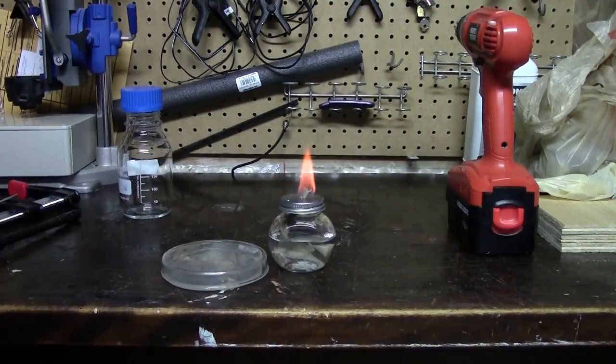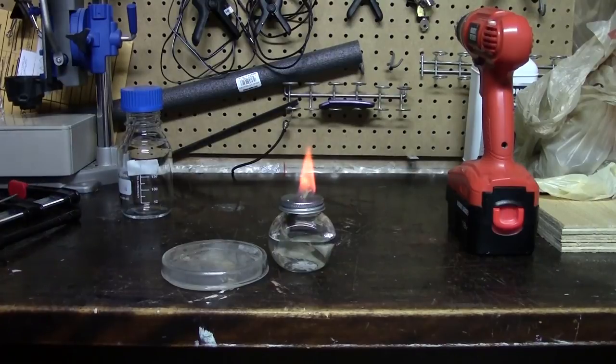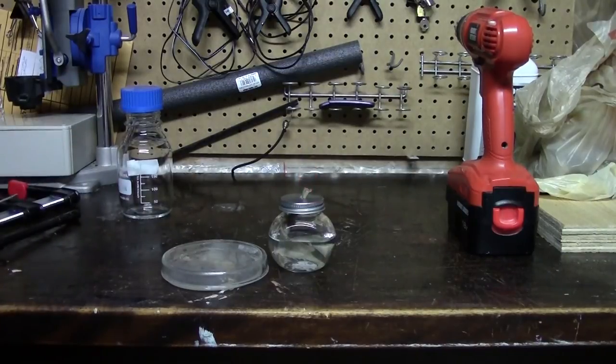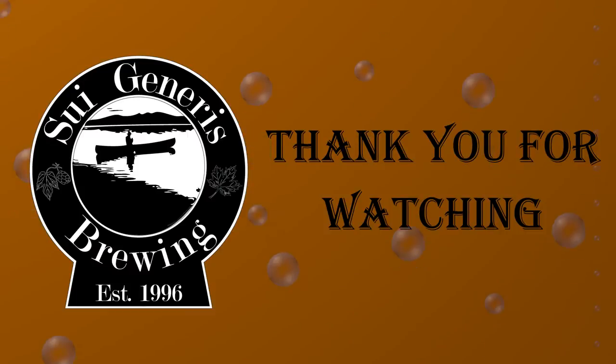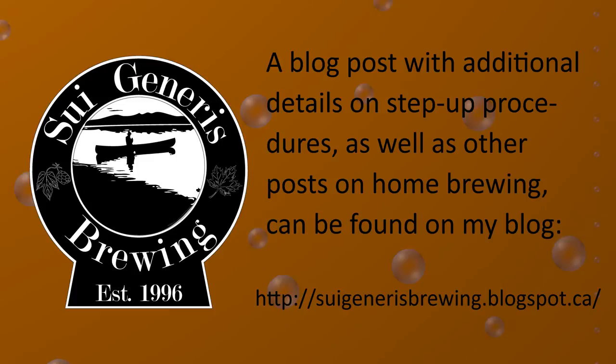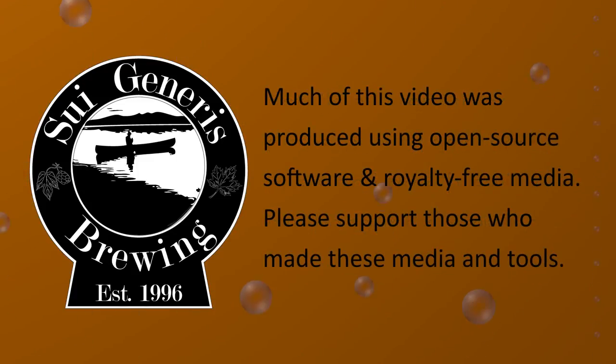Now, of course, when everything's done, you need to put it out. And the nice thing with the alcohol lamps is usually you can just blow them out. There we are. So that's the basics of an alcohol lamp - how to build it, how to use it. In my later videos, we'll obviously show you using this for very specific things like making streak plates or picking colonies.